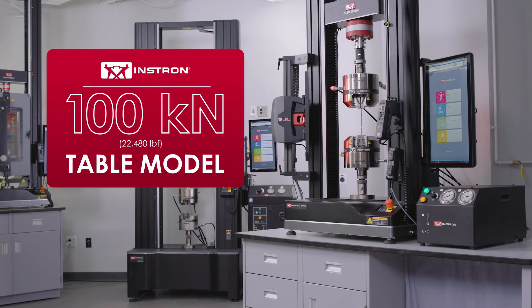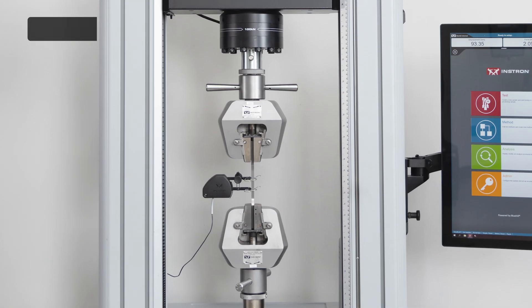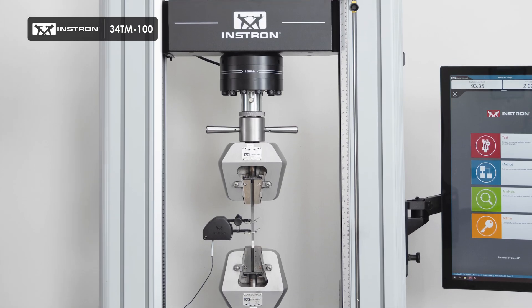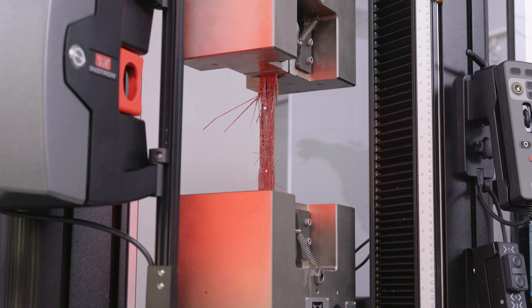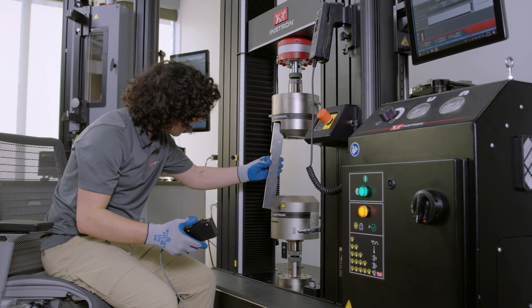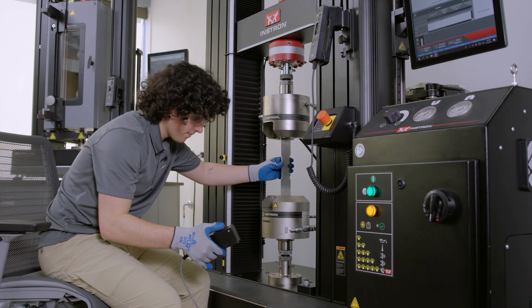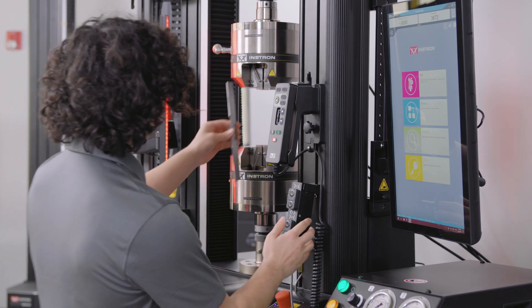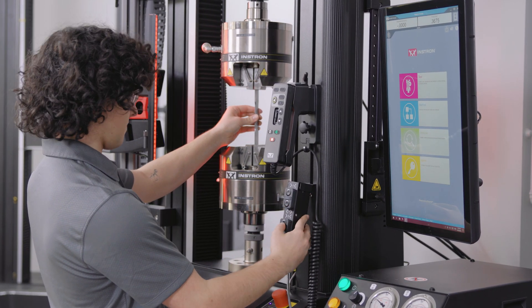Introducing the all-new 100 kilonewton table model for Instron's 6800 and 3400 series universal testing systems, delivering high force testing capabilities in a compact form factor. Until now, 100 kilonewton force capacities were only available in Instron's floor model systems. But thanks to advancements in engineering, we're excited to elevate the testing power for table model systems.